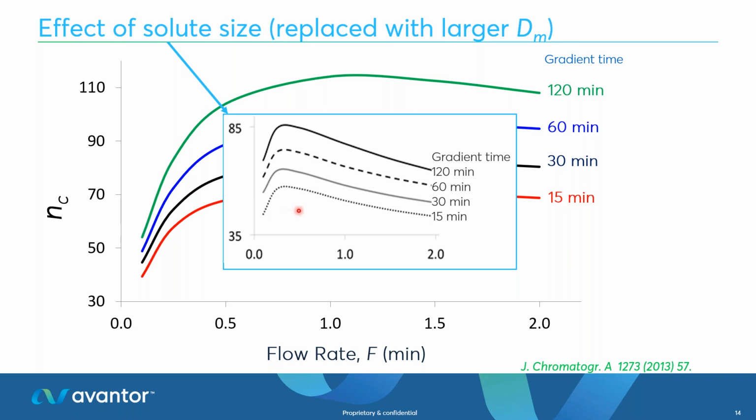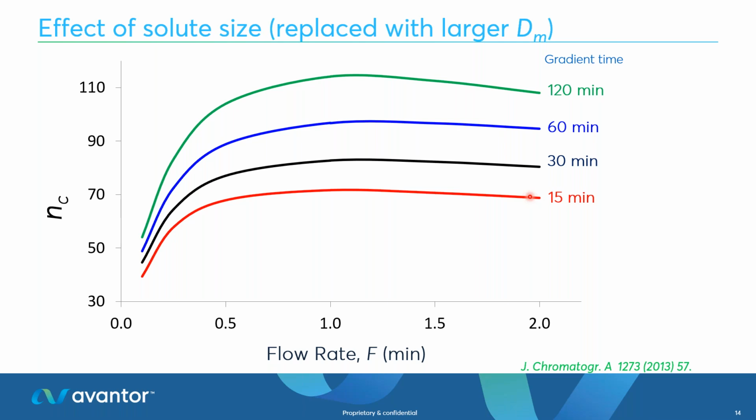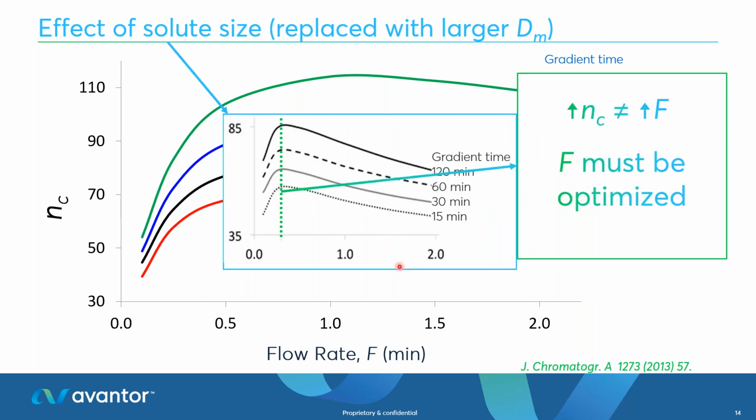So what this means is when you're developing a method for peptides, you do need to do some systematic experiments: a slow velocity, a fast velocity, and bracket that with some different systematic data points in between. You need to know where that maxima in peak capacity is, because you need to choose a flow rate around this region. For small molecules, you're okay because that velocity decision is easy. Just simply push that as fast as possible.